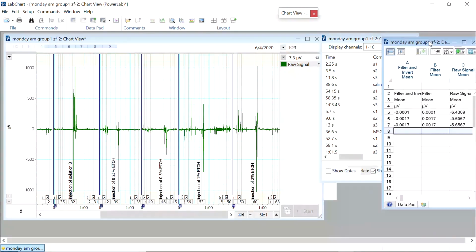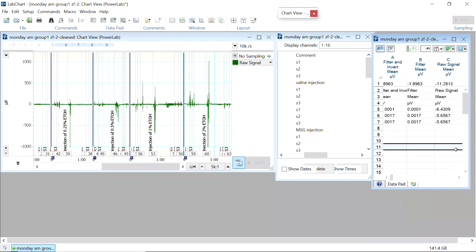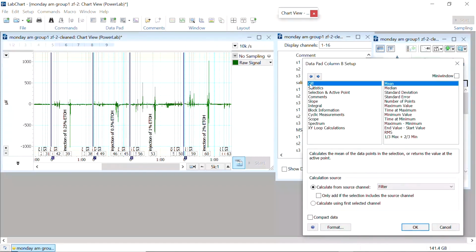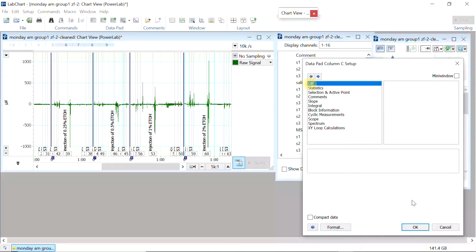and move that aside. Okay, so there are some readings already in here, so I'm going to clean up all these things. These are from previous readings. Okay, and then I really don't need readings of these numbers, so I can just turn off some of them. So let's click off, it's gone. And then the next column, off, it's gone.